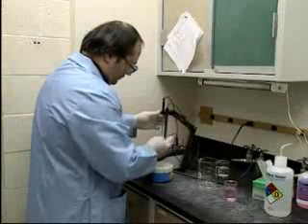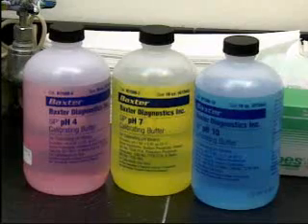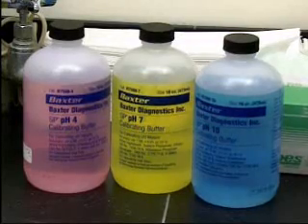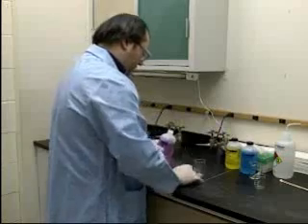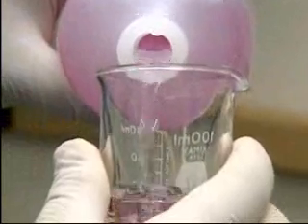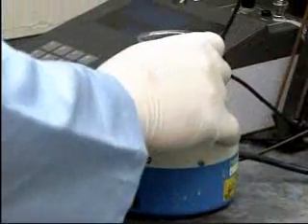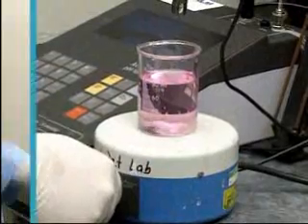Once the probes are clean, the next step is to standardize the pH meter. A pH meter is standardized using a solution called a buffer solution, which has a known pH. Generally, a buffer that is close to the expected pH of the sample should be used. In this example, a buffer that has a known pH of 4 is added to the beaker.